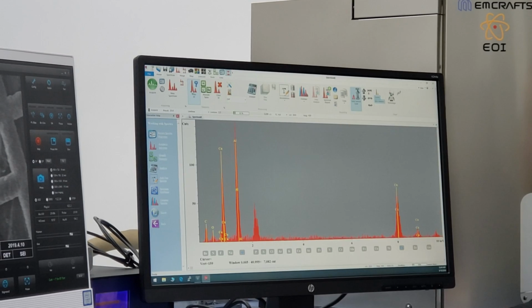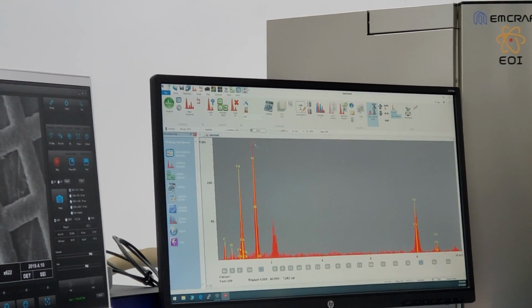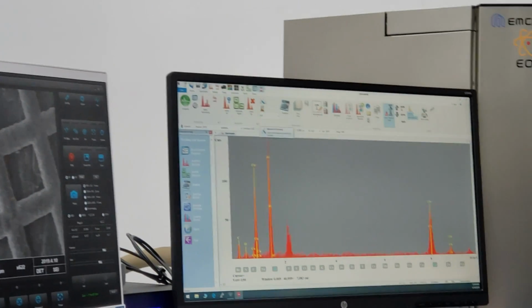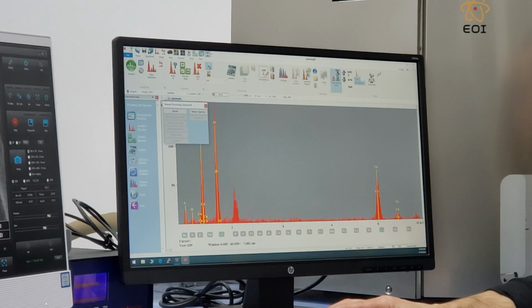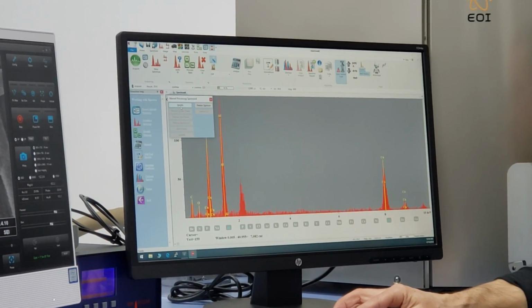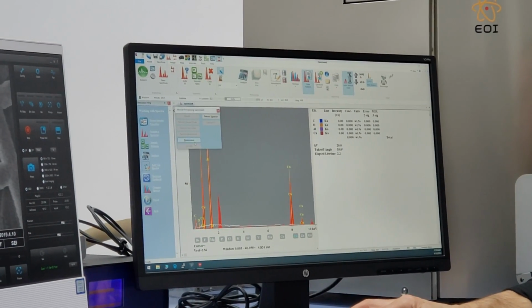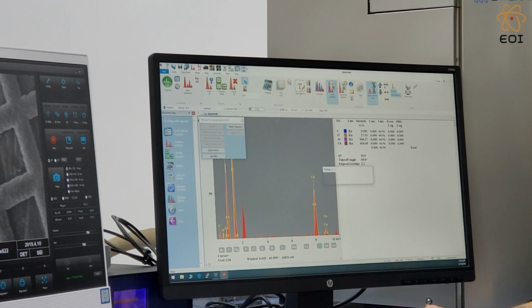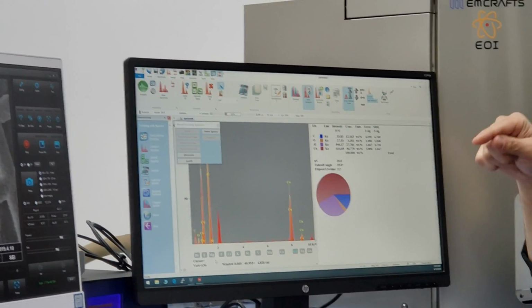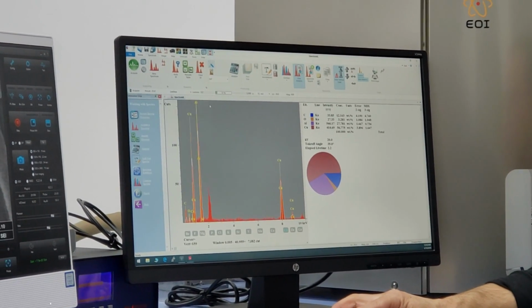Auto ID labels the peaks, great. Periodic chart, another reading from a periodic chart there. Clears the information. Re-auto ID. Right now this is manual processing, so this works step by step. If you wanted to manually process the information, you smooth it, remove the escape peaks, remove the background, deconvolute the spectra, quantify. So that did everything manually for you, instead of hitting the calculator. Okay? So let's just restore the spectra back to where it was.